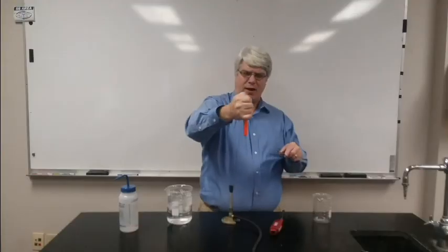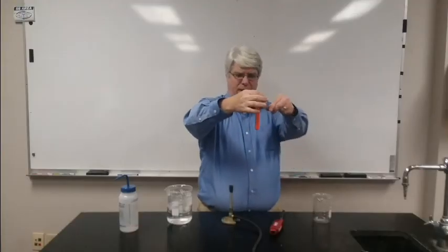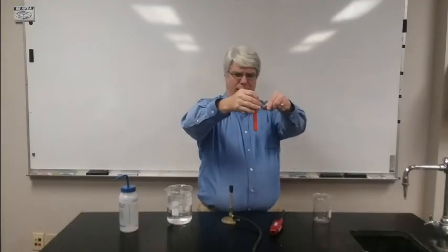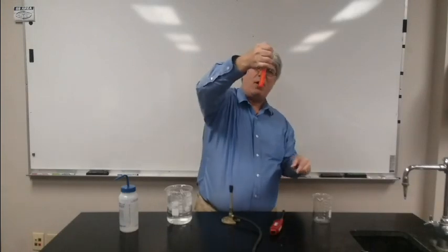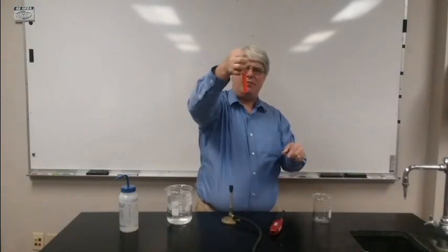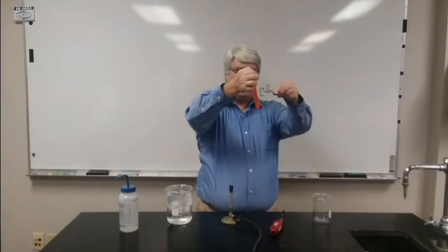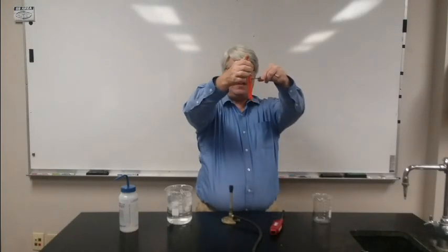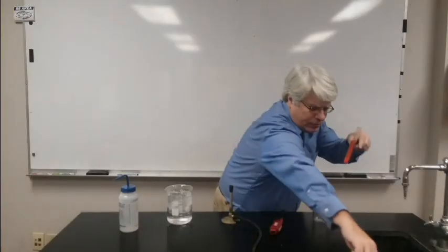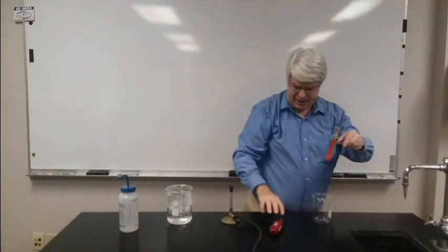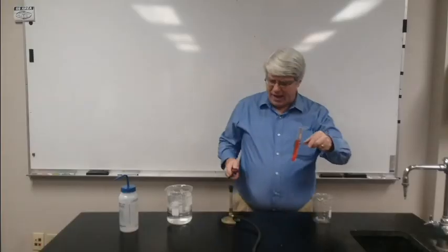It's really down there deep. I've finally gotten it and broken it up a little bit. You can see it's partially dissolved, but there's still a lot of solid in there. So what I'm going to do to try and get this stuff to dissolve, I'm going to heat it up.